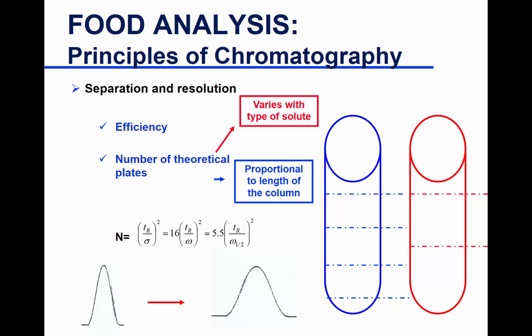And N is different for every compound because every compound will reach equilibrium differently, as it interacts with the column differently. Then after 6 months, you run caffeine again and find that your N went down, because you're losing capacity of the column: you're stripping off some functional groups, blocking some functional groups, so you lose efficiency over time, and equilibrium takes longer to be reached.